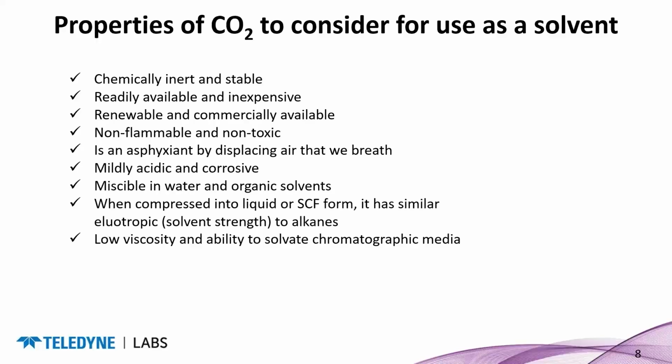It's readily available and inexpensive. It's renewable and commercially available. When you buy CO2 from a gas supplier, we're basically reusing CO2 that was generated from some other process. So that's why we refer to it as more of a renewable or green source.